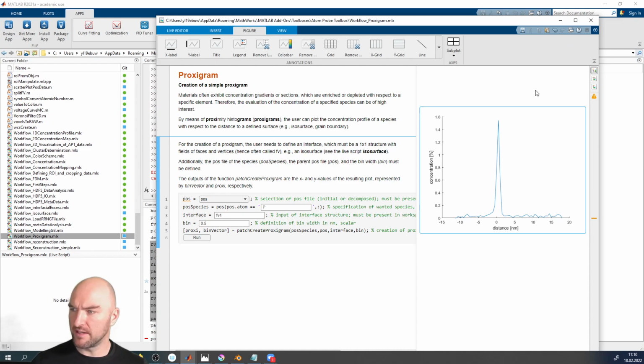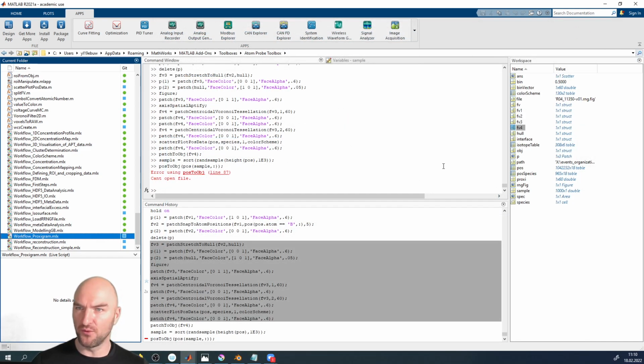So if you missed the last session, the data set is the grain boundary simple one that Martin has sent out. Its run number is R04-11350. I've used that one quite a lot.